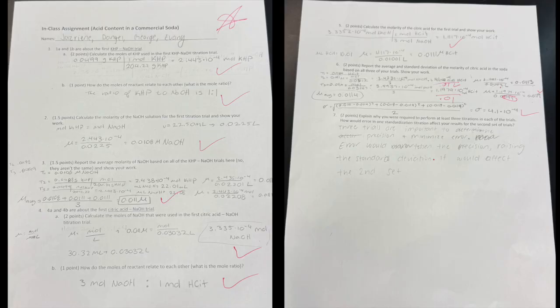Since citric acid is a triprotic acid, the mole ratio between it and NaOH is 3 to 1. Therefore, divide the moles of NaOH delivered to the soda by 3 in order to find the moles of citric acid. Next, divide the moles of citric acid by the total volume delivered to find the molarity of citric acid in the soda.